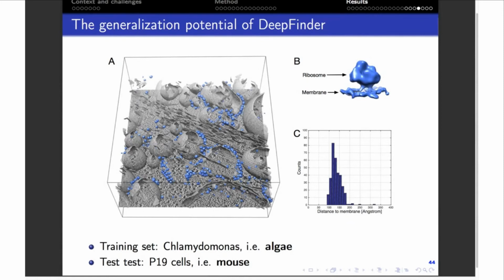So this figure represents a preliminary result, which can help us imagine the future of cryo-ET analysis. We can imagine that in the future, the biologists could have access to a bank of pre-trained general-purpose neural networks ready for analyzing new data. Here, the biologists would not need to execute the annotation and training themselves. It would have been done beforehand by other research teams.